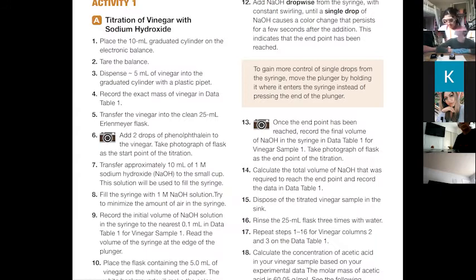So we have like 5.31 grams of vinegar. Yeah, you can smell that, right? So we're going to write that down. We have 5.31 grams of vinegar. Now, using the density of the vinegar, we'll be able to convert that to a very precise volume. So we take that off.